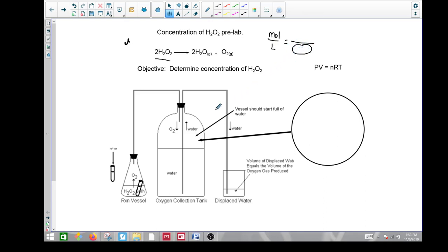Other things that happen, well, it decomposes. It produces O2. It also produces, I don't have it on my picture here, H2O. So two gases are produced pretty quickly here. Again, if you don't see something taking place, then there's something wrong. So let me know.